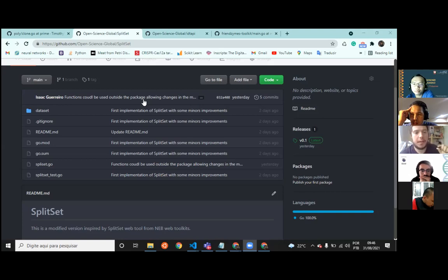Okay, so right now I have this plasmid diluted in some liquid, some reagent. The next step is to transform this plasmid, or no, I will not make this transformation. I will use a restriction enzyme kit to break this plasmid into a linearized form. So we want to linearize your plasmid, and this means that right now the plasmid could receive other enzymes, basically. Yes. We use maybe BsaI for this, I think, in the design. That we designed using BsaI to insert new enzymes.